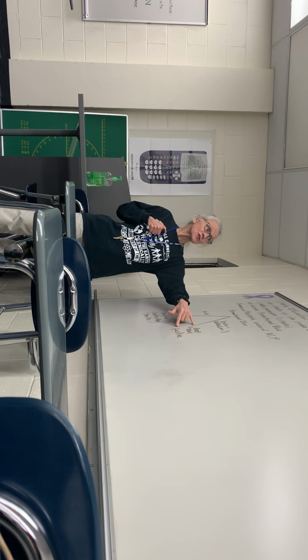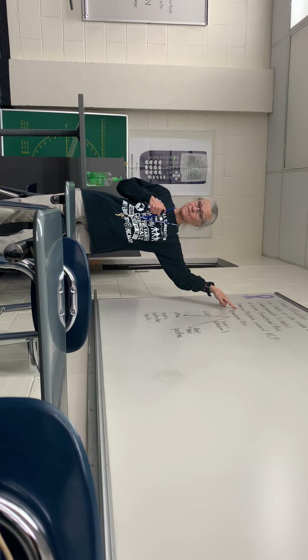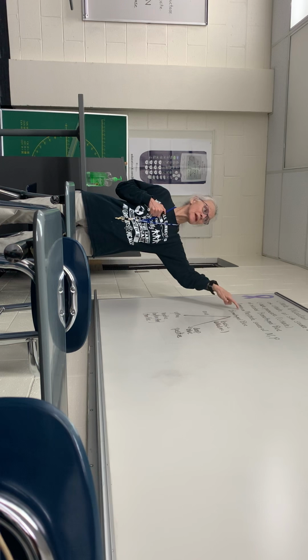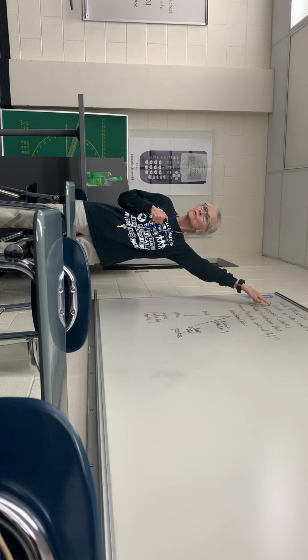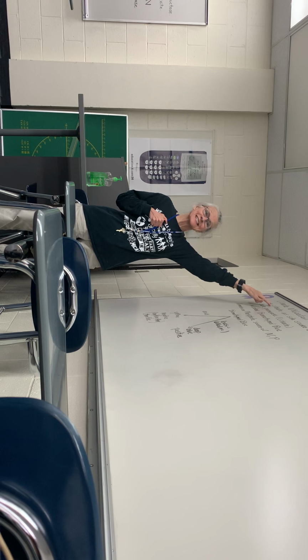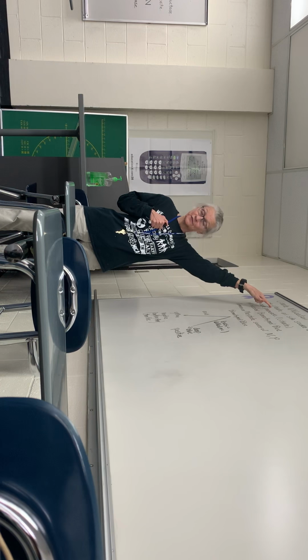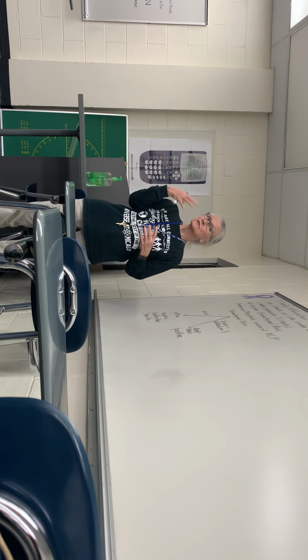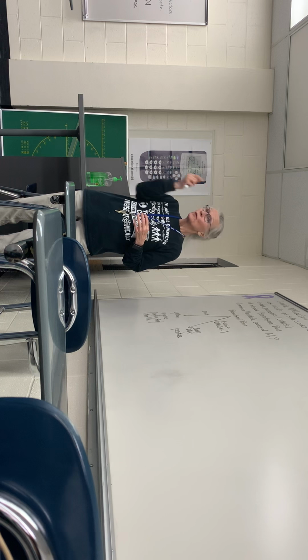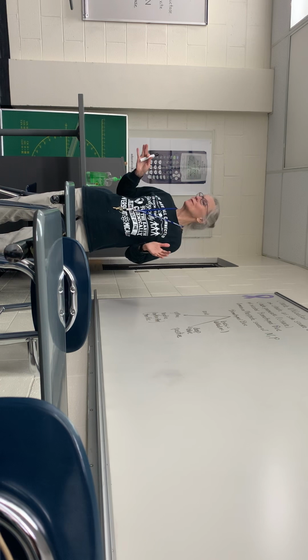What you're actually visualizing is the breakdown of ammonium phosphate for nitrogen. But you know if it's doing that, it's doing this too, because the only thing in there that the organism can use for carbon is the citrate. So if it's doing one, it's doing the other. So they go hand in hand. So even though we're not visualizing the utilization of the carbon, we know that's happening in that test tube. That's the only thing in there it can use for carbon.